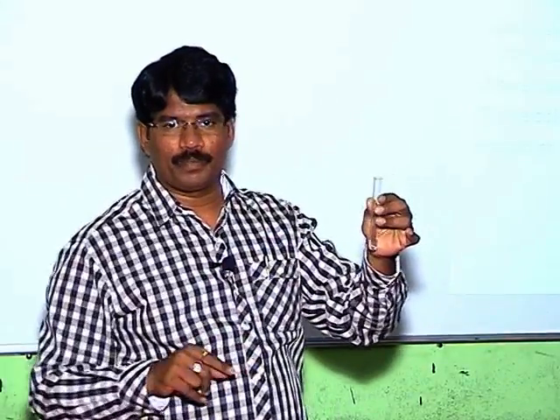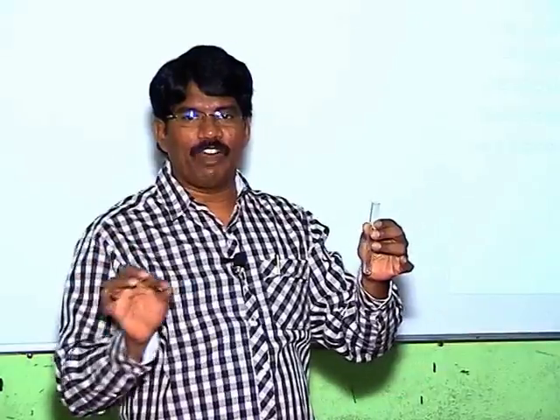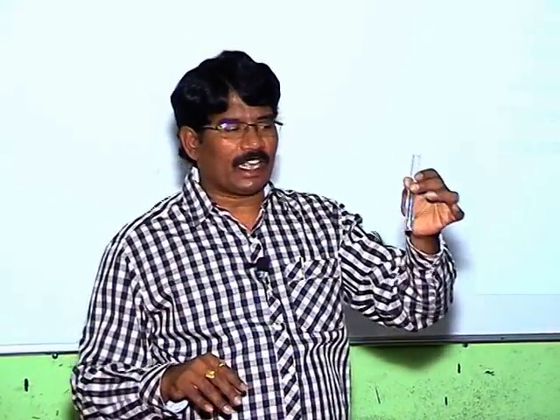Suppose quick effervescence is observed, then carbonate is present. Then immediately we need to expose a burning splinter to the gases evolved from this test tube. If quick effervescence is observed, then the burning splinter will be put off. There also we need to mention that carbonate ion may be present.